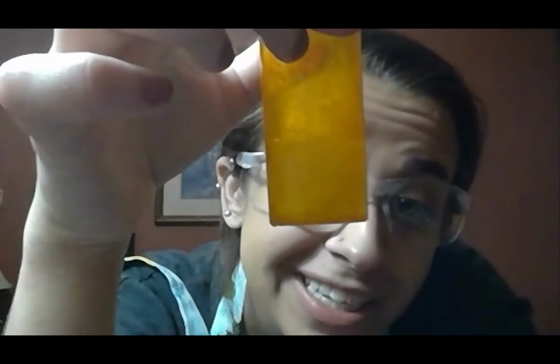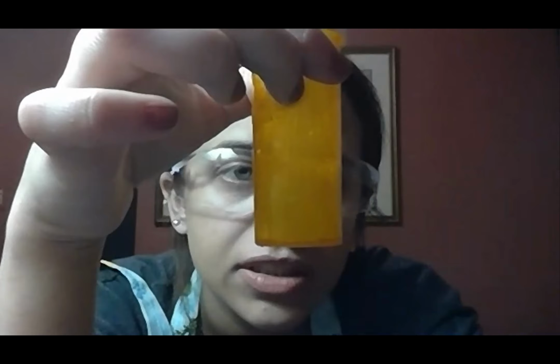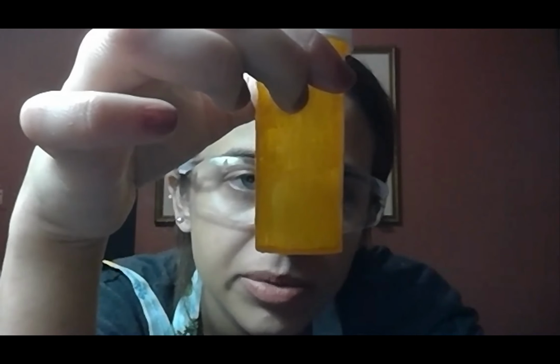For the rest of our experiment, we have to make sure we're consistent with the way that we're recording. So I'm going to start the timer. As you can see, this one is not bubbling nearly as high as I don't think any of the previous ones, so tests B through E. And it's still going, pretty slow bubbles forming.